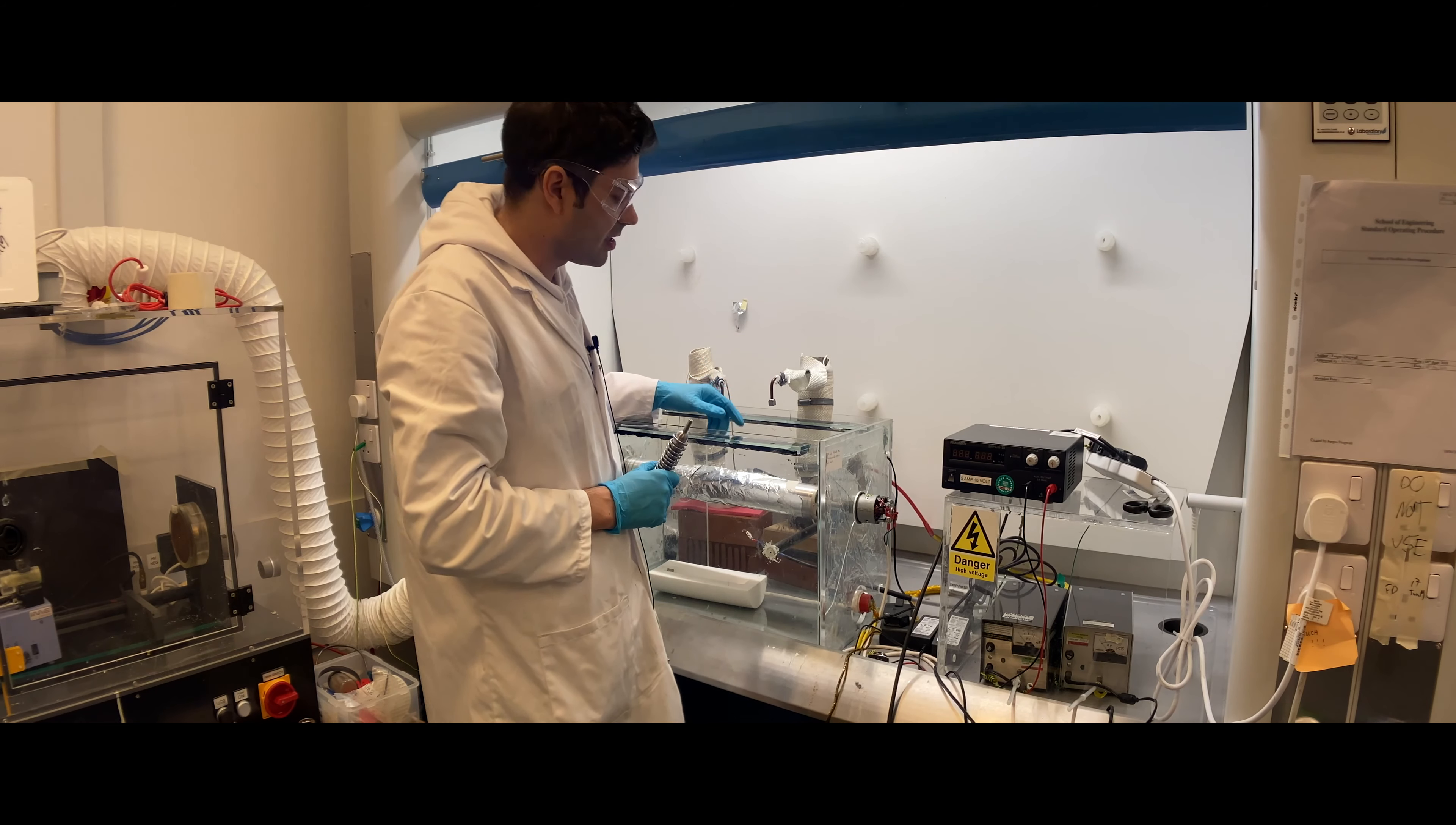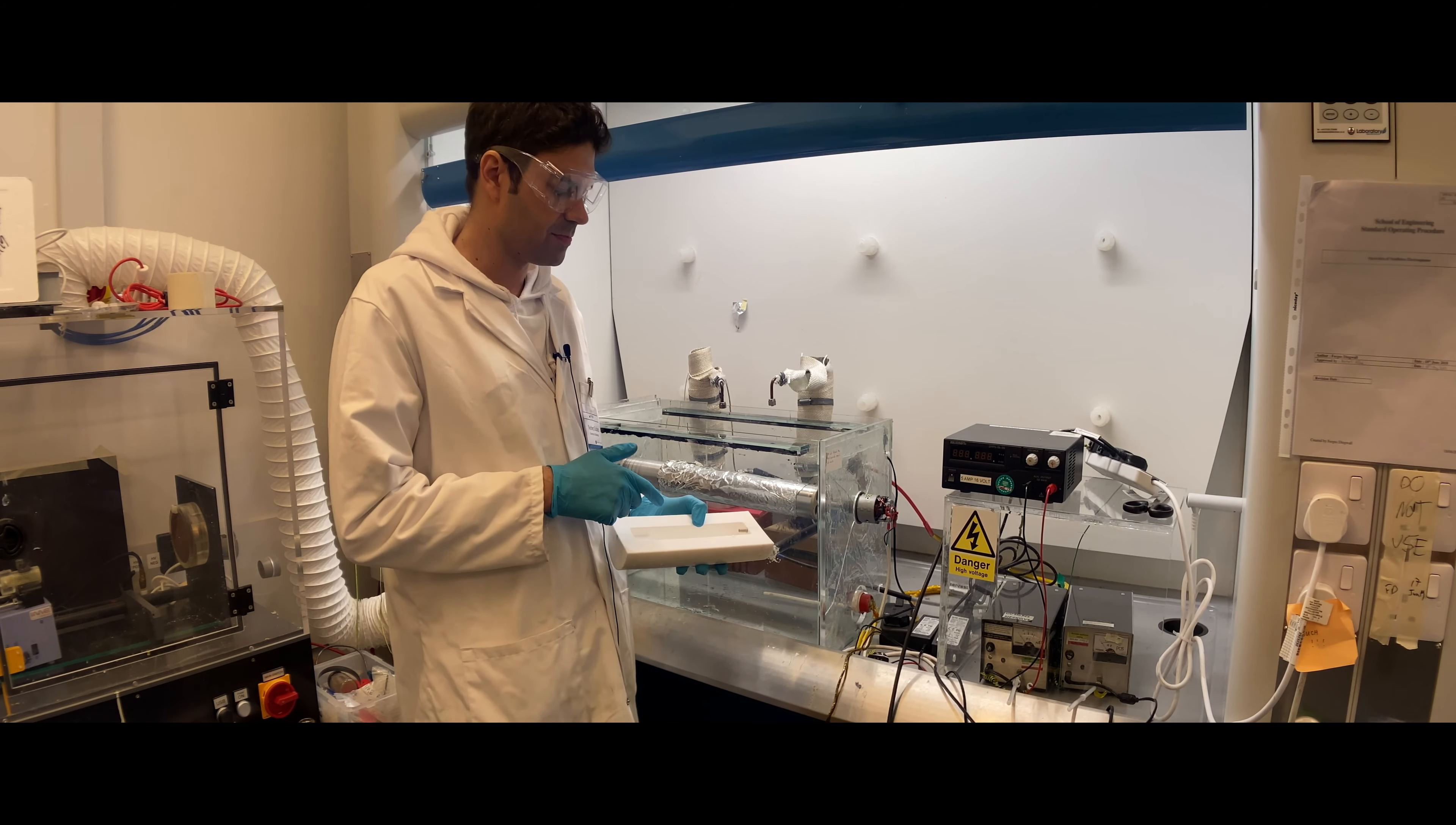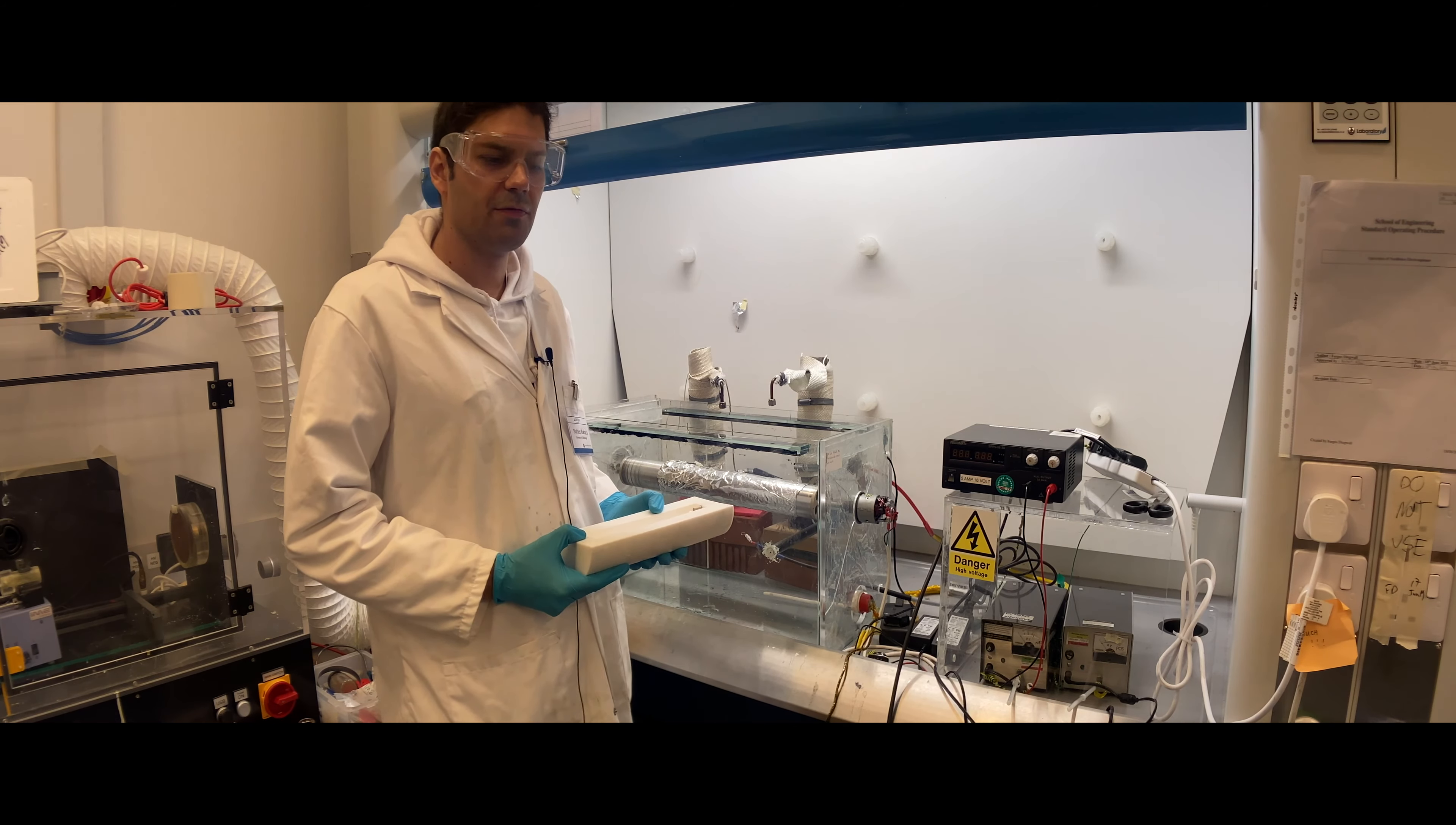You can collect the electrospun samples by taking off the aluminum sheet before you remove this. At the end, you should dispose of the leftover electrospinning solutions or you can put it back to the original bottle if you want to reuse it. I hope this instruction video was clear. Let me know if you have any questions.